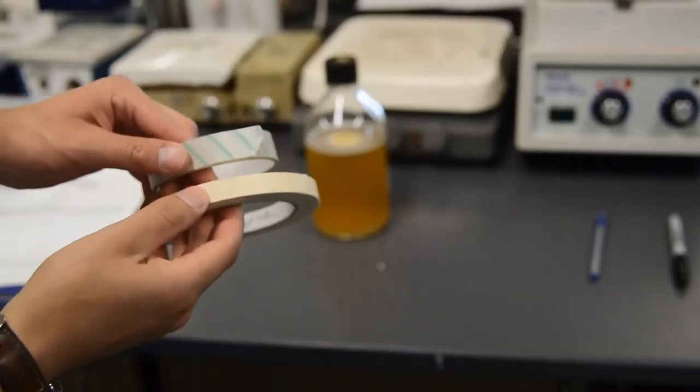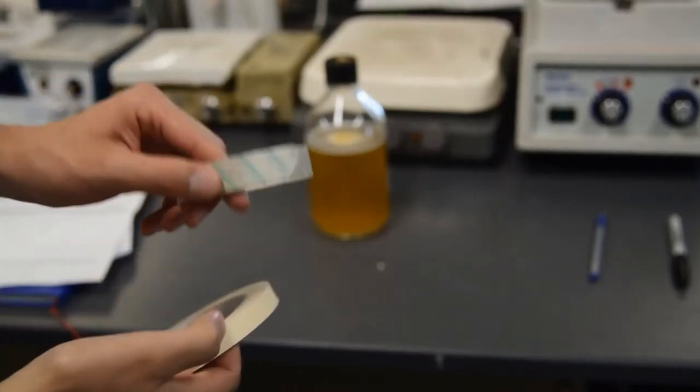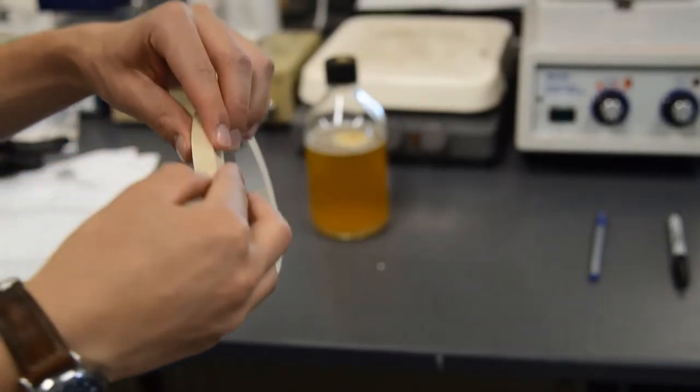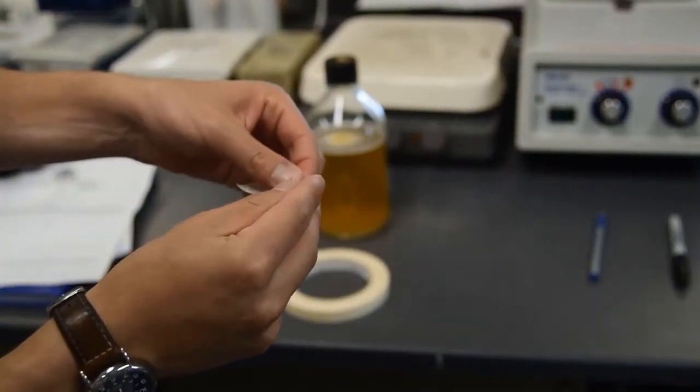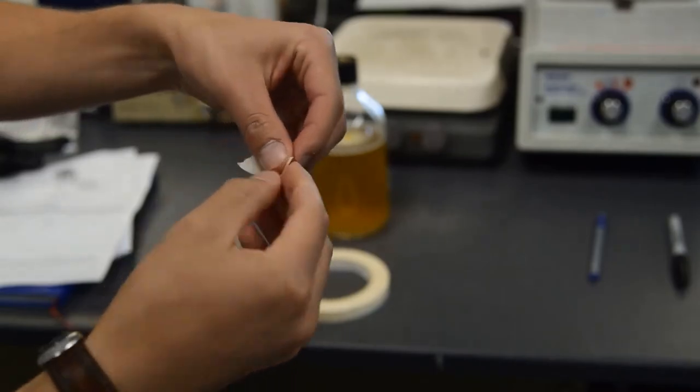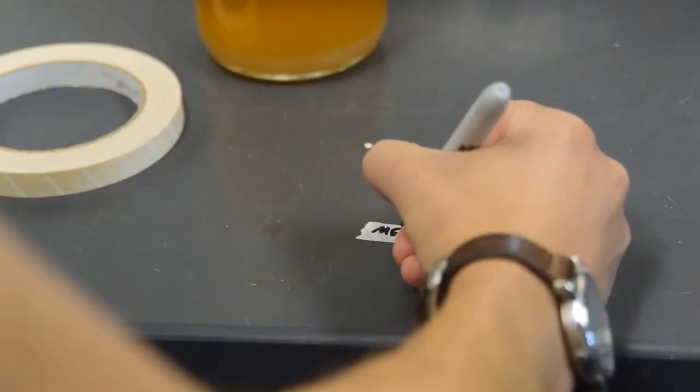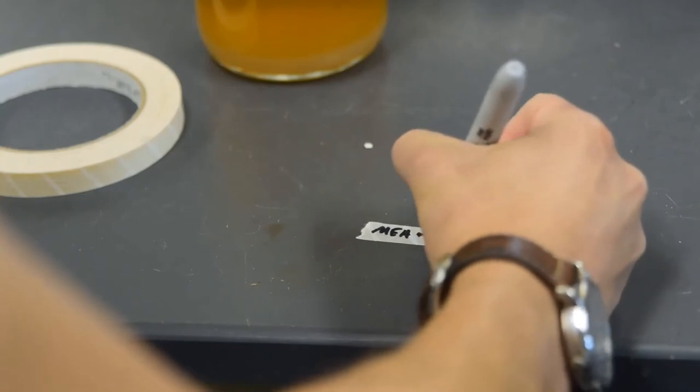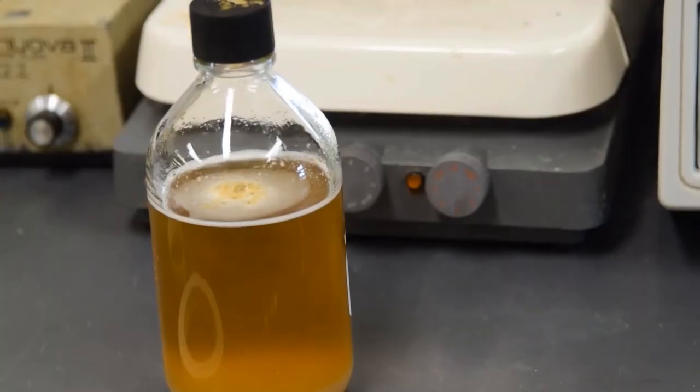Now we need to put autoclave tape on it. This tape changes color once it's been autoclaved, and there's two different kinds. We're going to use this kind. I'm just going to tear a piece and fold over the end. This allows it to be put down on a surface and picked up more easily. Going to write the media type on the piece of tape and then apply the tape to the bottle across the seal line.